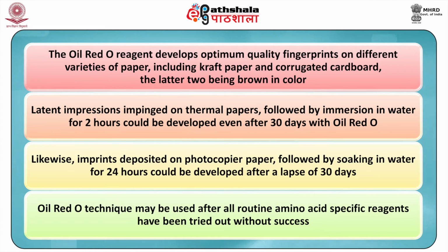Latent impressions impinged on thermal papers, followed by immersion in water for 2 hours, could be developed even after 30 days with oil red O. Likewise, imprints deposited on photocopier paper followed by soaking in water for 24 hours could be developed after a lapse of 30 days.